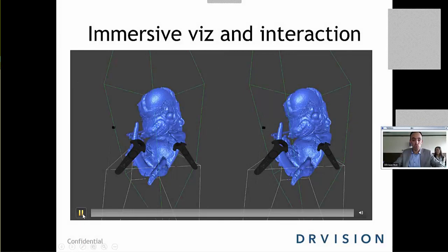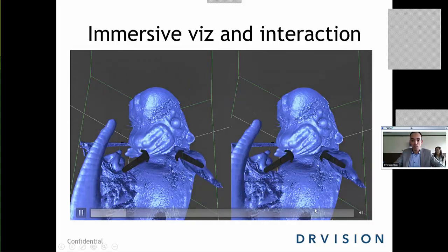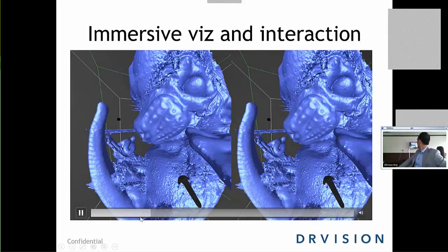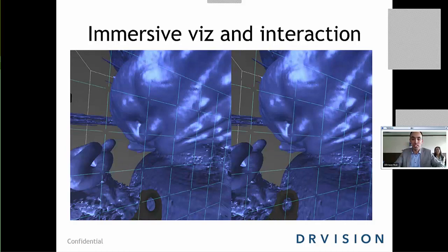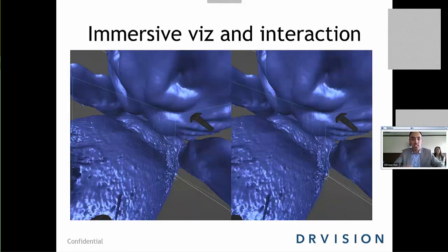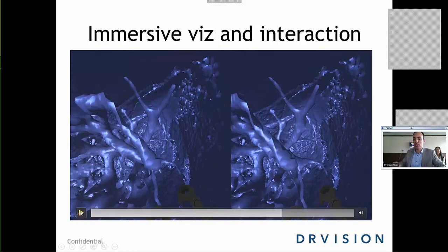Here's another data set we'll look at today. It's an embryo, and here it's a solid surface. And I'm zooming in. It's kind of a quick movie, that's why it looks jumpy. But it's possible to go inside of an embryo like this and look at some of its structure. So right now, I'm going to pause it there so that it catches up.